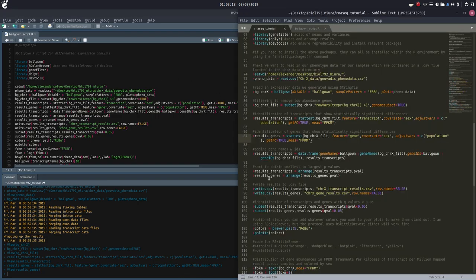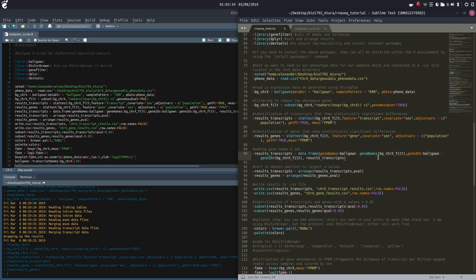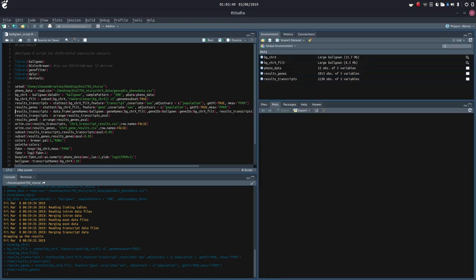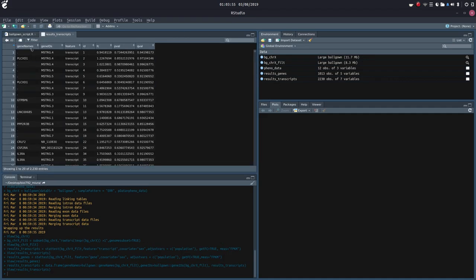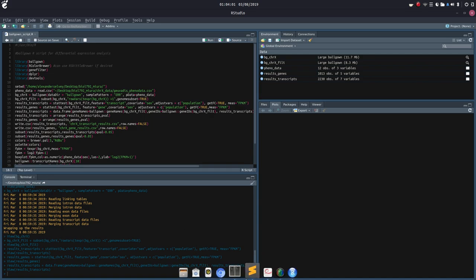Next, we're going to add gene names and IDs to our results_transcripts. We're going to create a new data frame — gene names from ballgown. We're going to pull the gene names out of ballgown using our BG_chromosome_X_filtered environment variable. The gene IDs are going to come from ballgown gene IDs using that same variable, and then we're going to write it to the transcripts. Let's do this — and we wrote our gene names to that environment variable, results_transcripts.